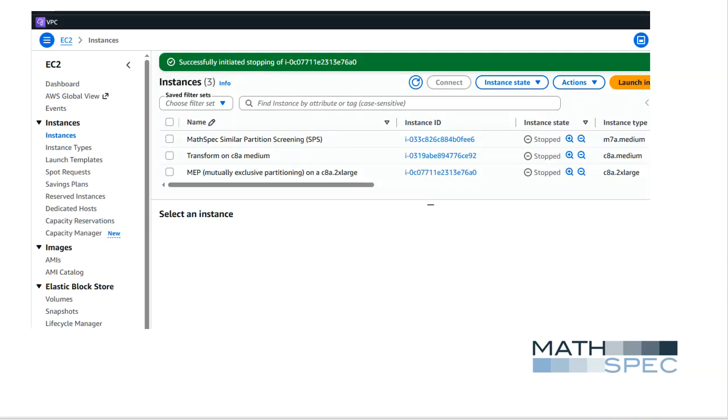You do not need to download or install this application onto your desktop because this application is available in the marketplace on Amazon Web Services. An instance is essentially a private server that has everything you need to run this application: the hardware, the Ubuntu operating system, the computer programs, and accessories such as Windows, Excel, and LibreOffice Calc templates for inputting and viewing the data.